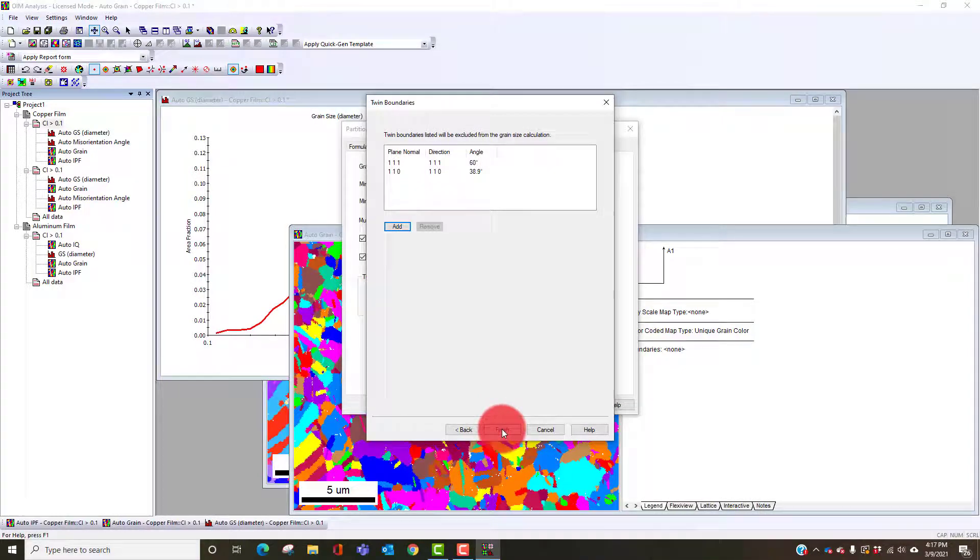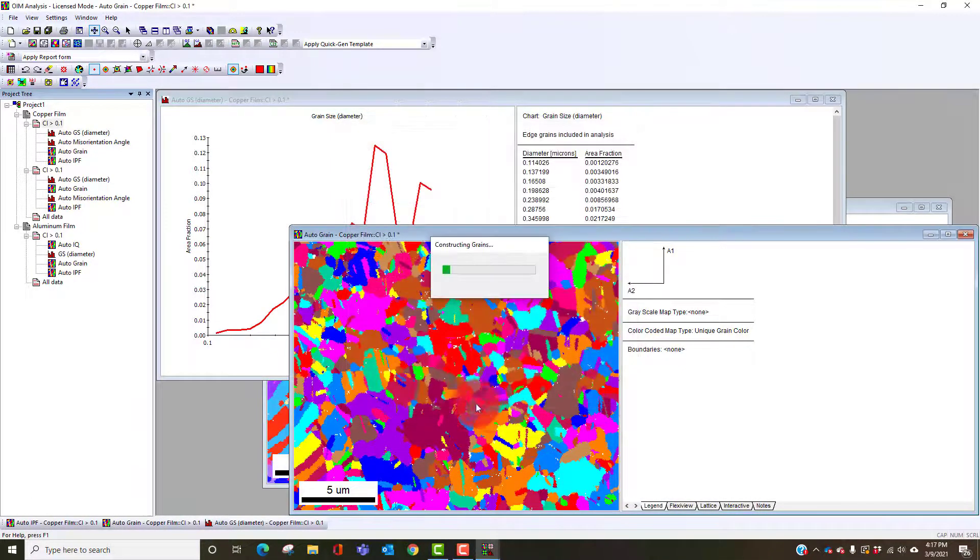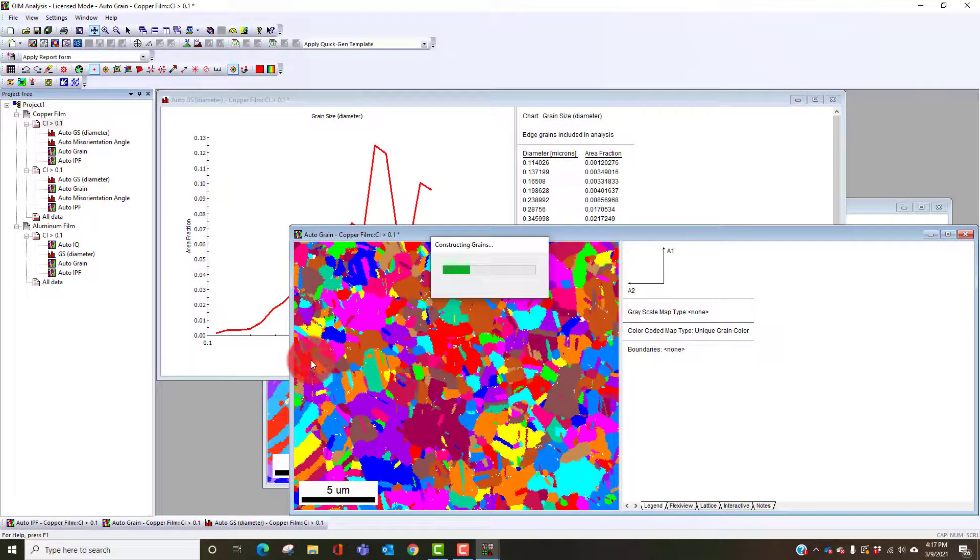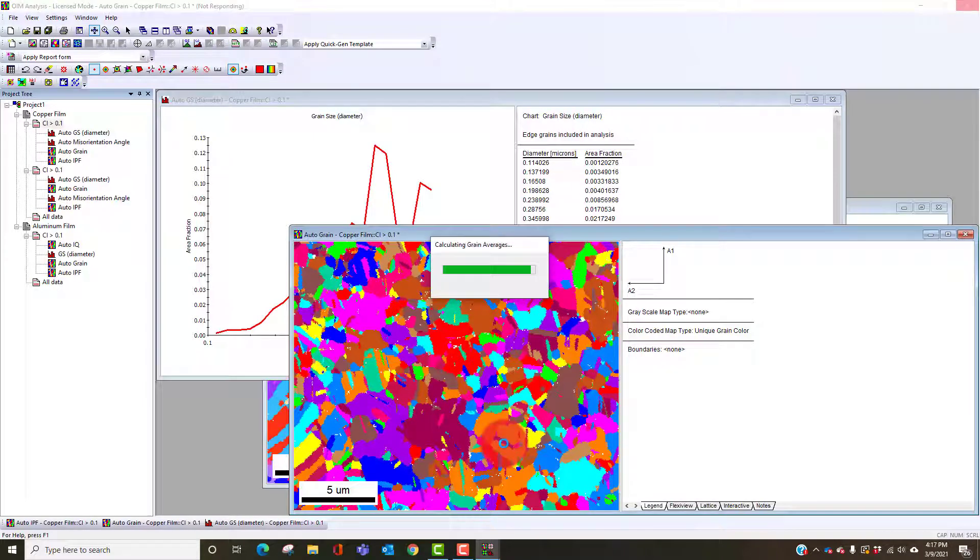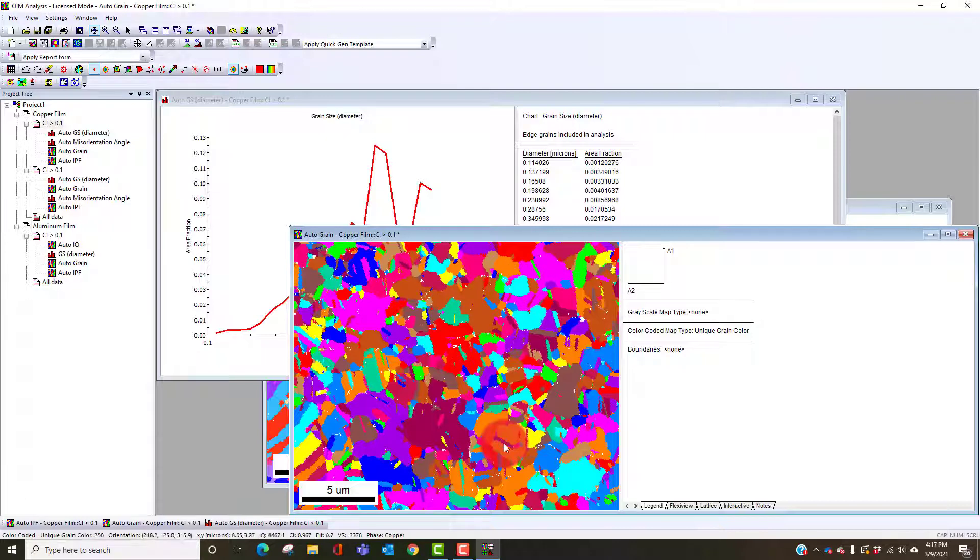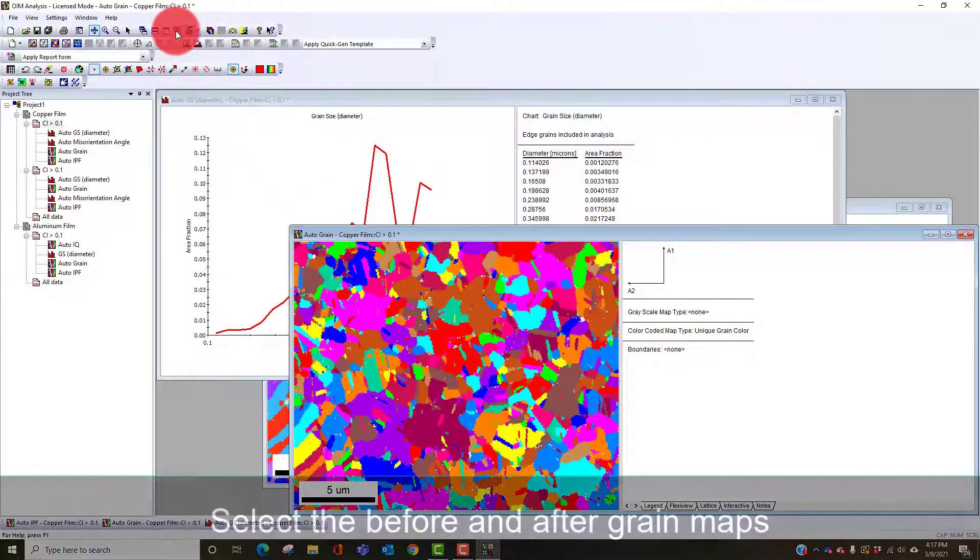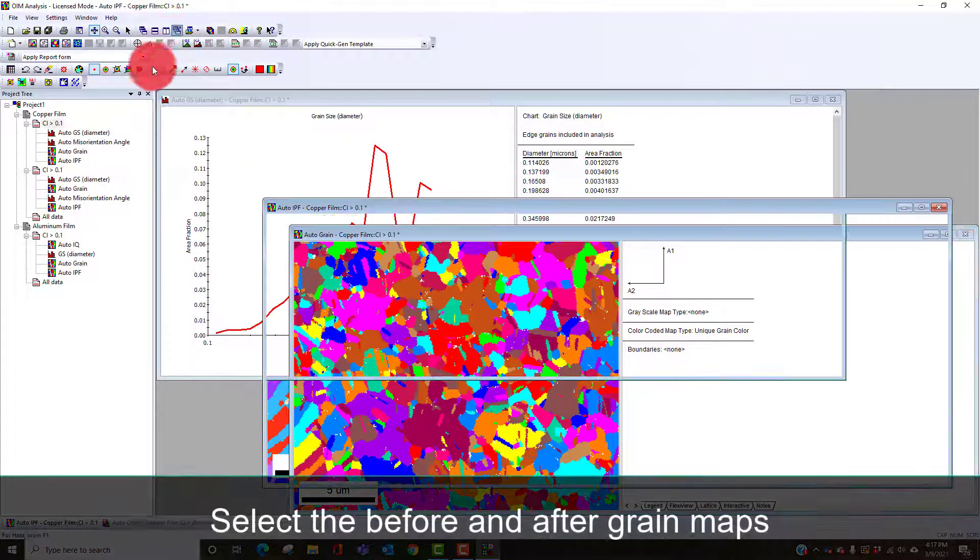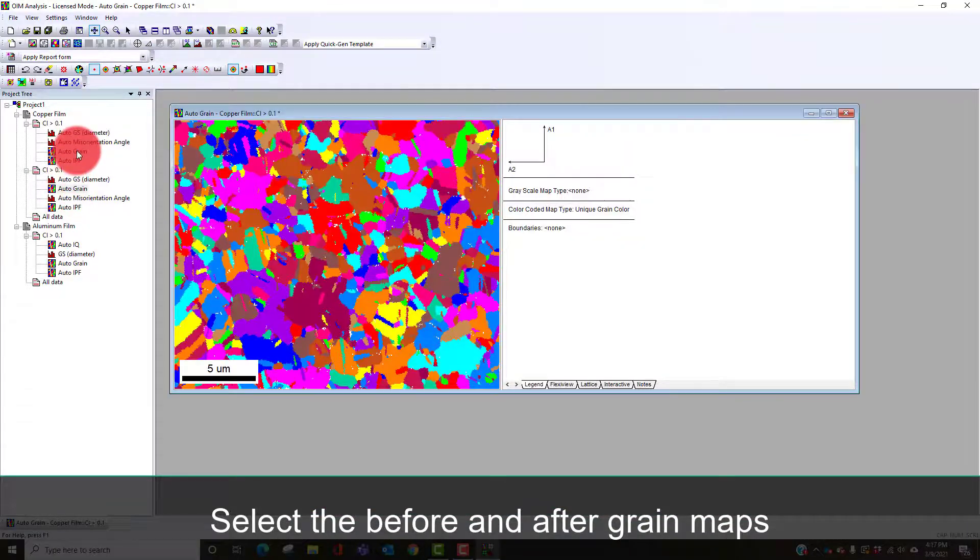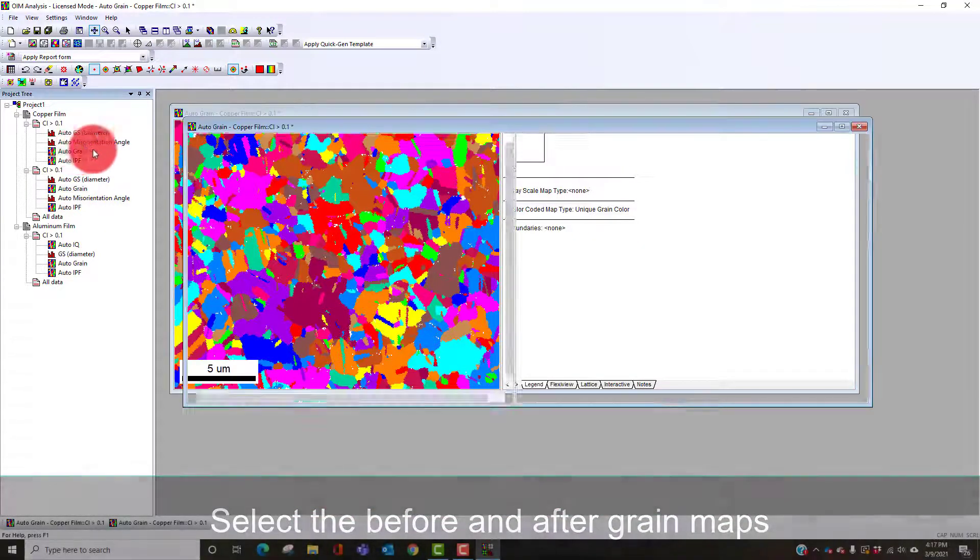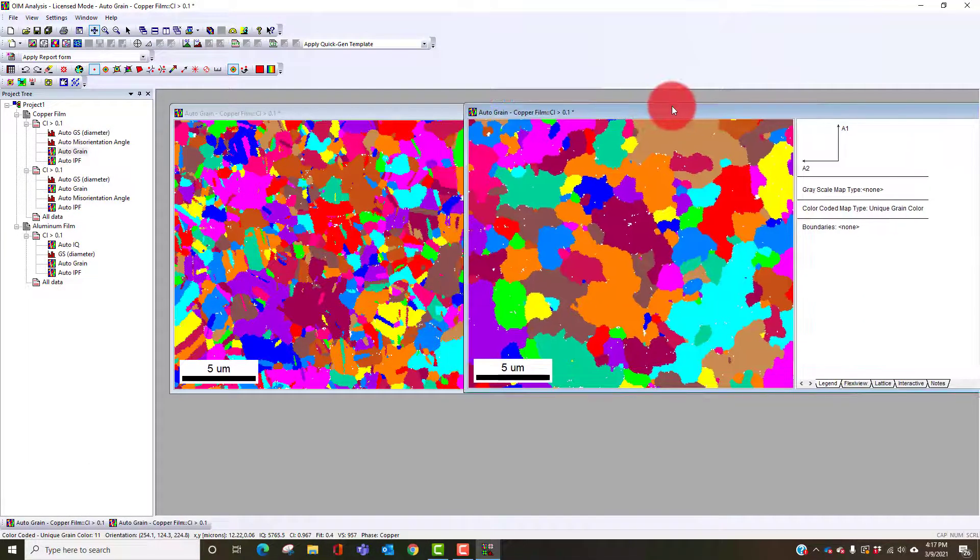I'll just use the defaults. Now it's going to recalculate the grains, but every time it finds a boundary that's defined by that specific misorientation it ignores that from the grain grouping. So now if we look at this, this is the grain map before, this is the grain map after twins. You see quite a difference in twin structure. We call this sometimes a twin corrected grain structure or grain map.